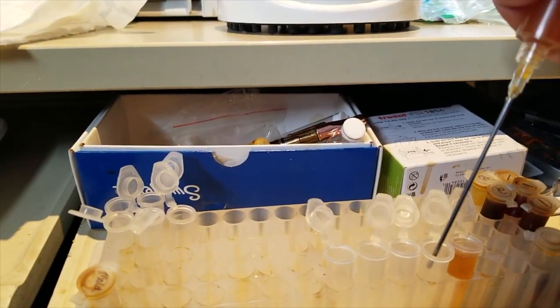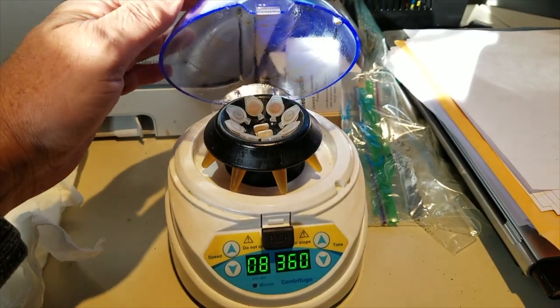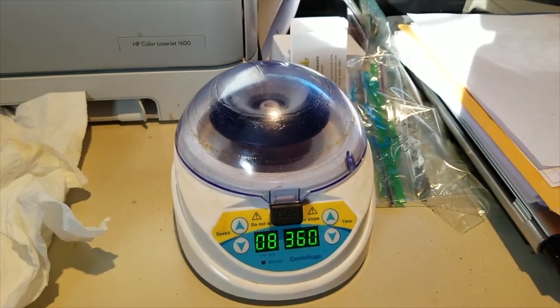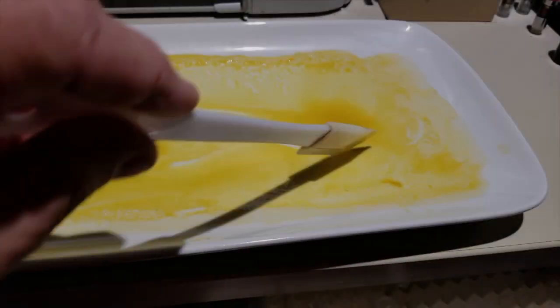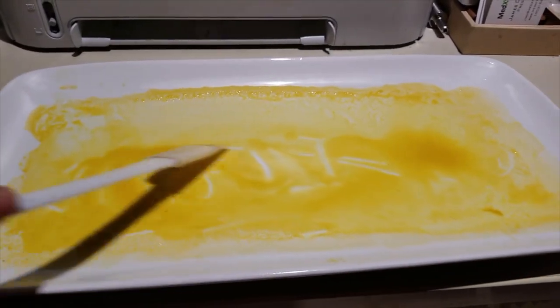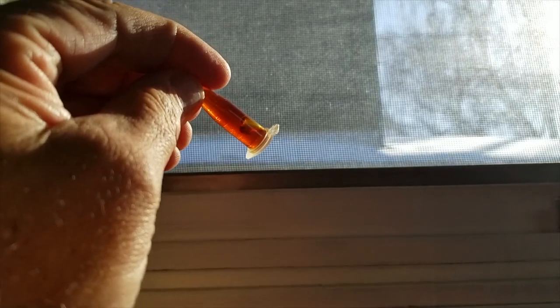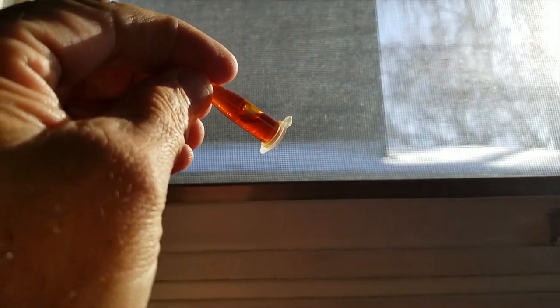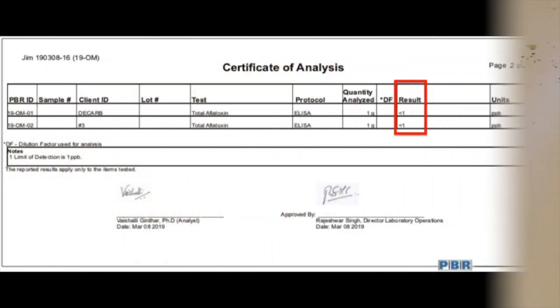Now we're going to put it into some small vials and place those vials into a small centrifuge to spin out some of the wax. We're going to run it for six minutes at 8,000 rpm. Once the spinning has finished, we pour the mixture into a tray to evaporate off the ethanol. Note the clarity and viscosity of this oil without winterization. Here are the vials that we're sending off to the labs, and here are the results.